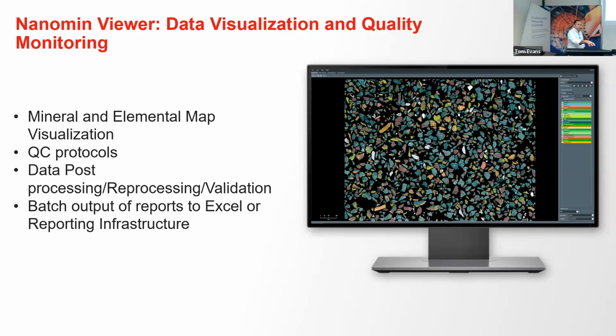But the idea is, instead of having a more expensive hardware solution, to use the software in a smart way to solve a challenge that we had. For example, make sure the stitching is perfect every time. The software can understand what features are repeated in that overlapping region to make that call. And most of the time, it will do it much faster and better than humans can. So the idea is to utilize the technology for those tedious tasks.